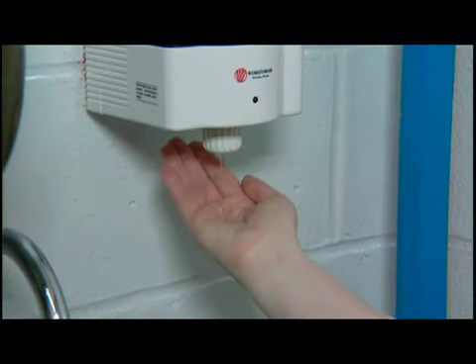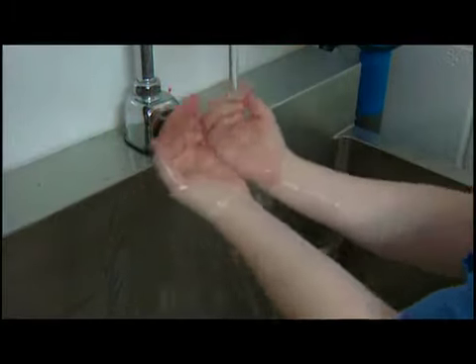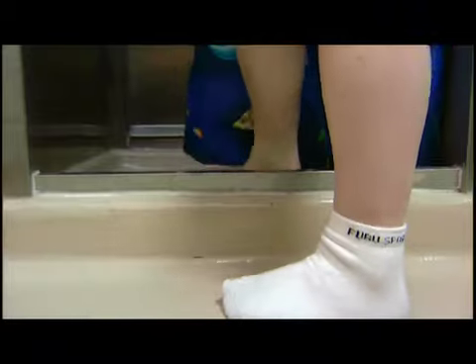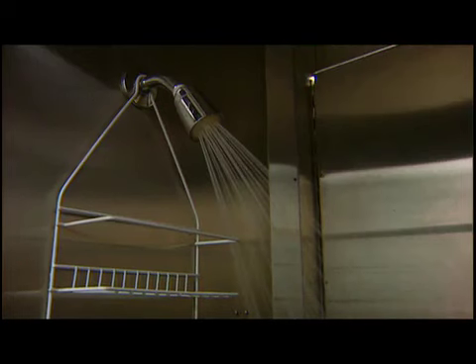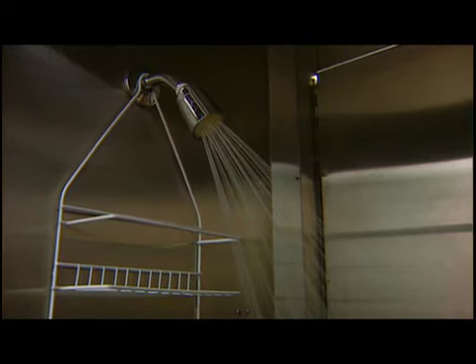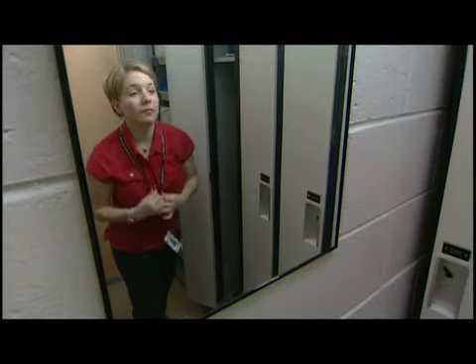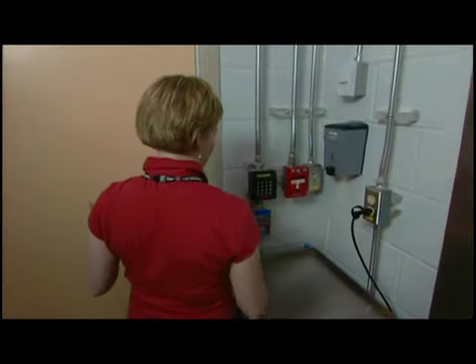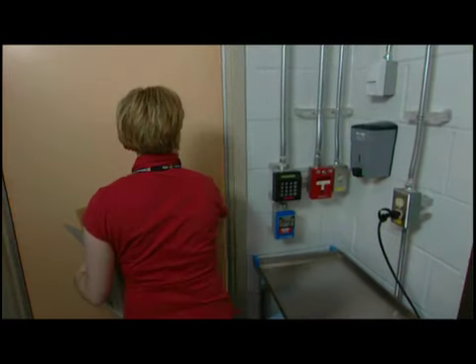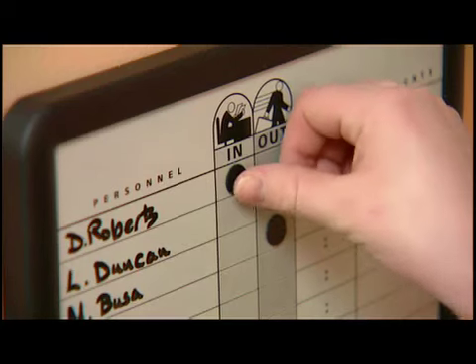If showering is not necessary, wash hands thoroughly. Place socks in dedicated autoclave bag and proceed through the shower into the clean change room. Showering may be required as per your SOPs, for personal preference, or in the event of a spill. As you are leaving, make sure the door closes securely behind you. Sign out and update the personnel board.